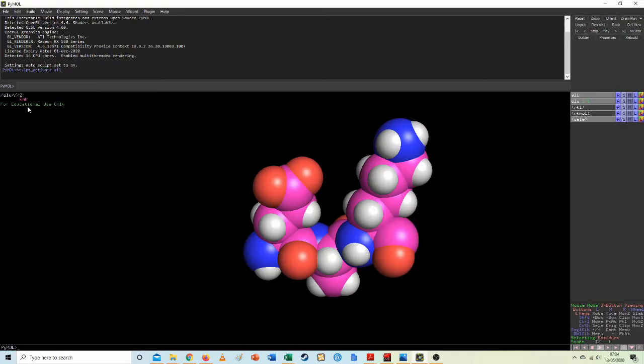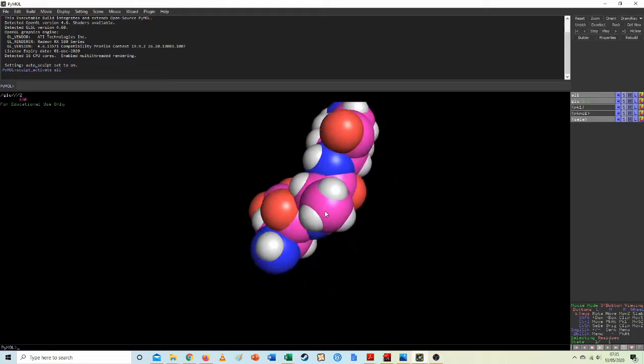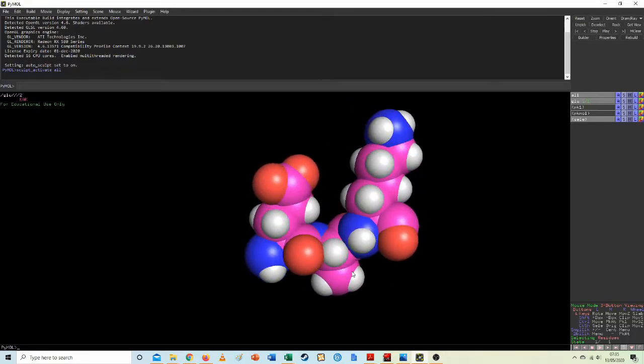Okay, I would like to. Yes, I will come back to it once we're done later. But that is our amino acid string, so a very short polypeptide. And this negative charge here will be attracted to that positive charge there. And we might find that if I can figure out how to do the next little bit, that this alanine rotates round, but we'll have to wait and see.